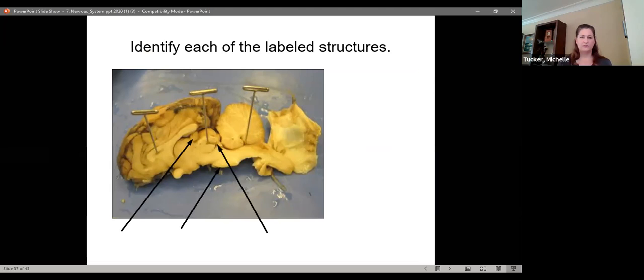Okay, so this is looking at the sagittal view again. Let's put a heart where the pineal gland is. Yeah, okay. And then a question mark at the pons. And an arrow at the, this is looking at the superior colliculus.